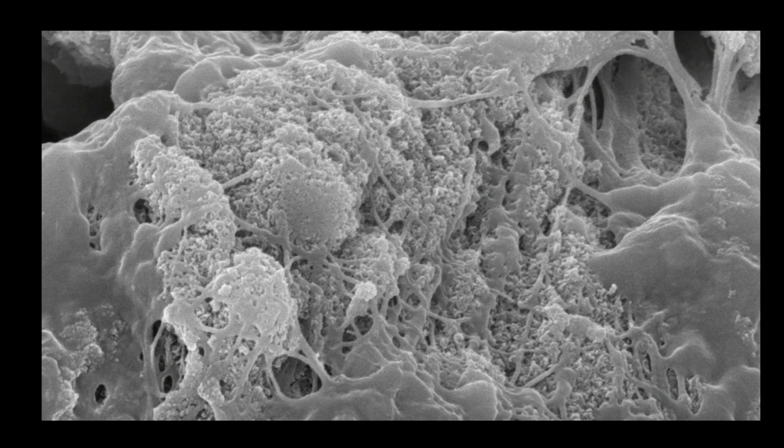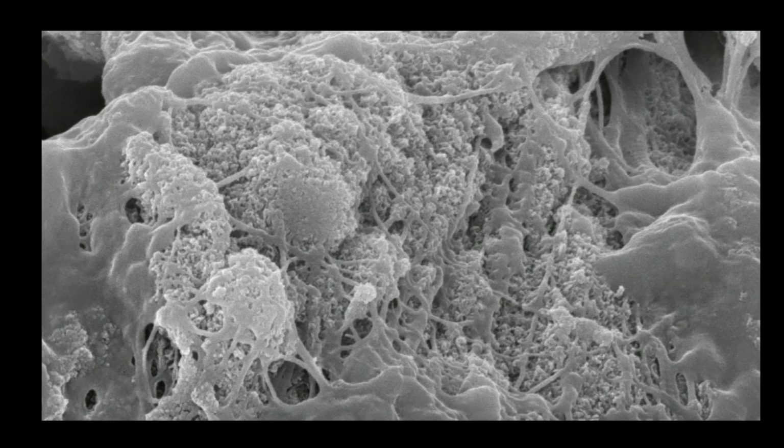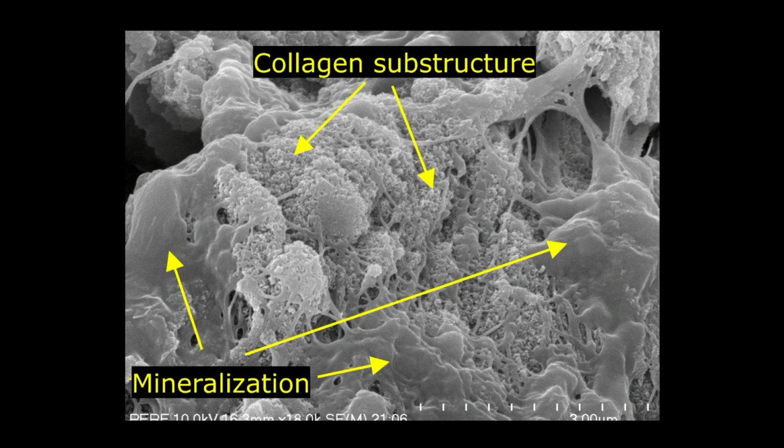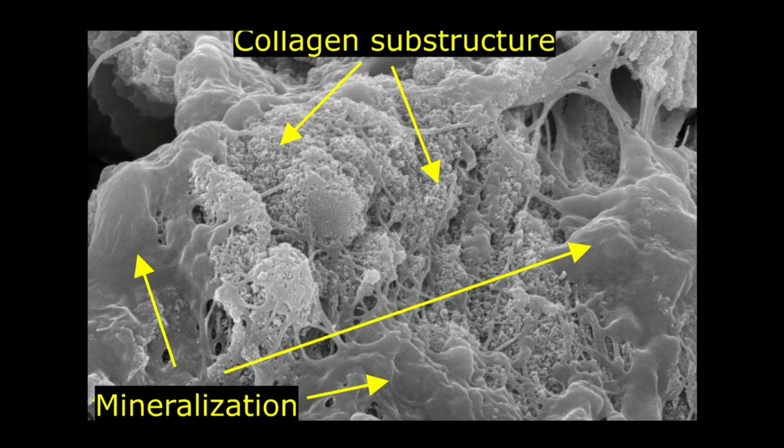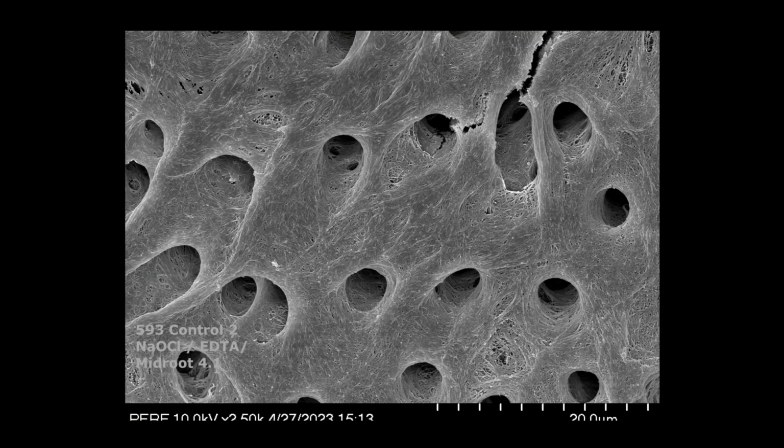You don't actually know which in these kinds of samples that we look at. So now you have a little better recognition of what you're seeing. And now when you look at a different condition of dentin, here you can see you get a sense for the collagen, but look in the tubules.